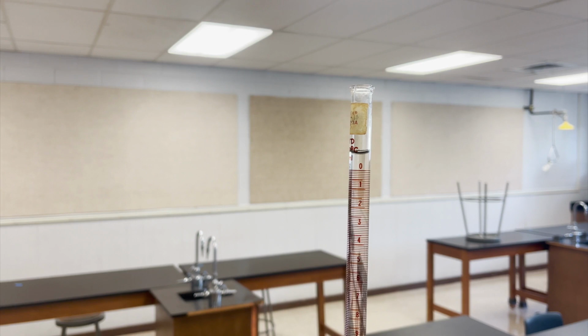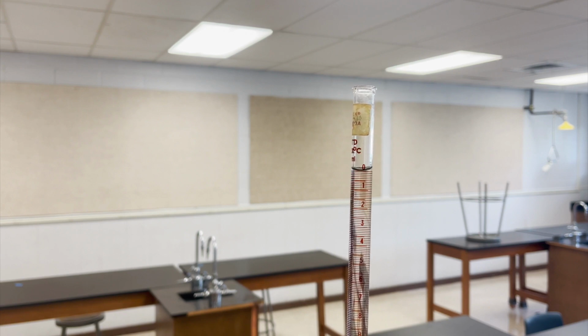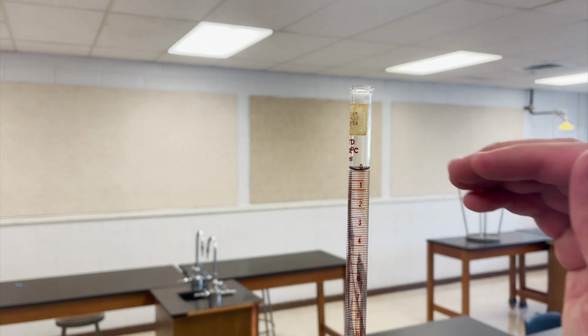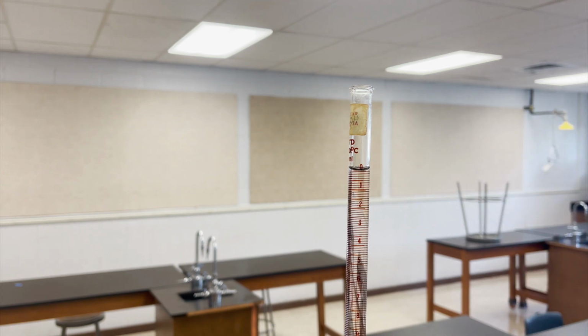So what we're going to do is slowly open this up, and then you'll see that it will start to go down, and you can control how quickly it goes down. We're going to get it right where the bottom of the meniscus is right at the 0 mark, and that's about exactly where it is. All right, yep, it's exactly where it's supposed to be. So what that means is we're starting at a volume of 0.